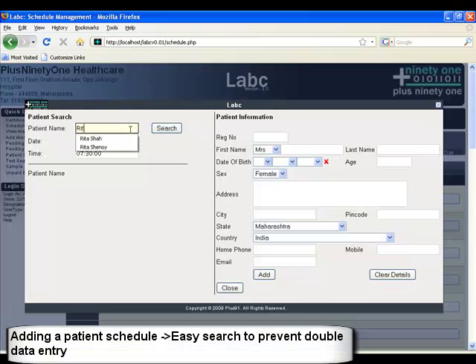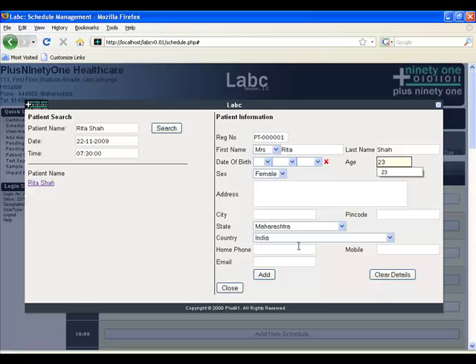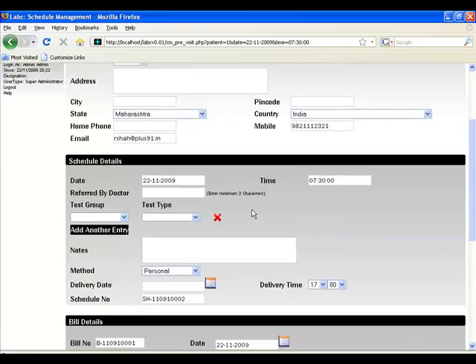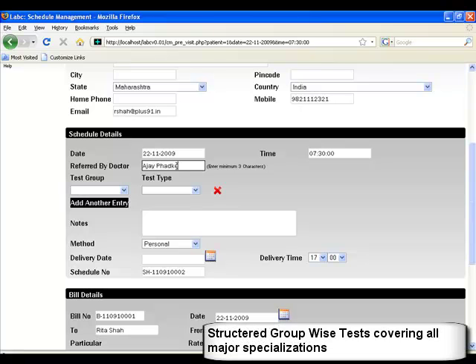Let us start by adding our schedule. Enter the patient name and click on the search option. In case the patient has come before, a name will be present and the information will come automatically. In case the patient is new, you can add the details. You can also add a referral or a referring doctor, which comes with an auto-complete option.